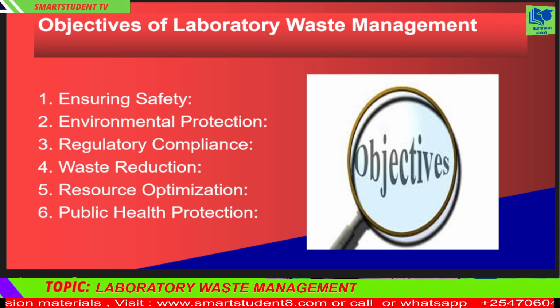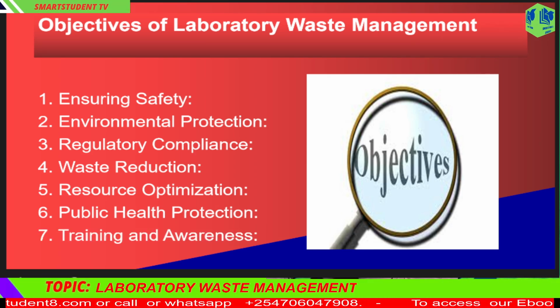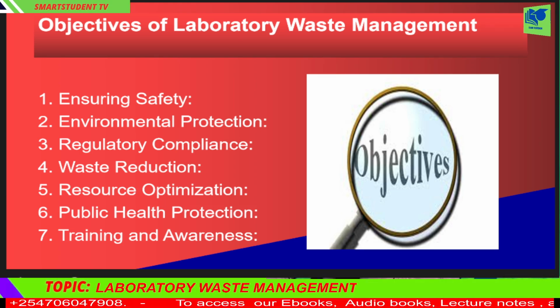6. Public health protection. Prevent the spread of infectious diseases caused by improper handling and disposal of biological waste. 7. Training and awareness. Educate lab personnel on best practices for waste handling, segregation, and disposal. By meeting these objectives, laboratories can create a safe working environment, reduce environmental risks, and contribute to a more sustainable future. Importance of laboratory waste management.